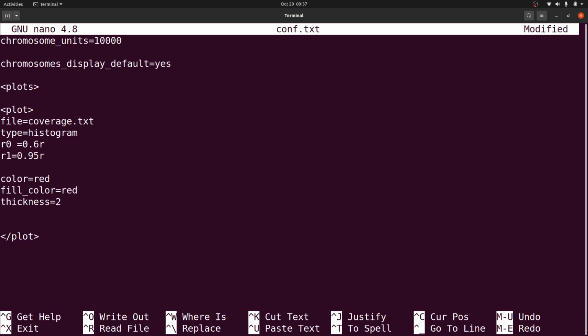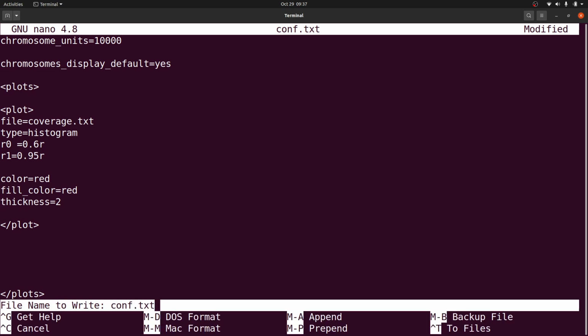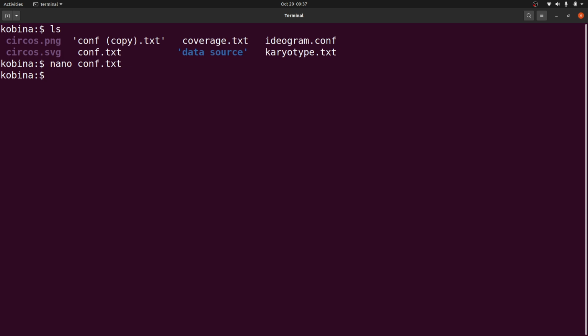All right, so that is it. That's all that we need for now. So this is also done. What we have to do is make sure that everything here is fine. So far, so good. So I'll save the changes, and then I'll proceed.